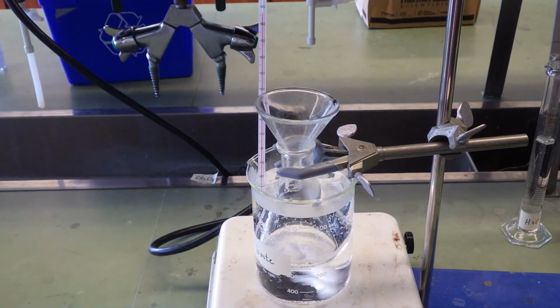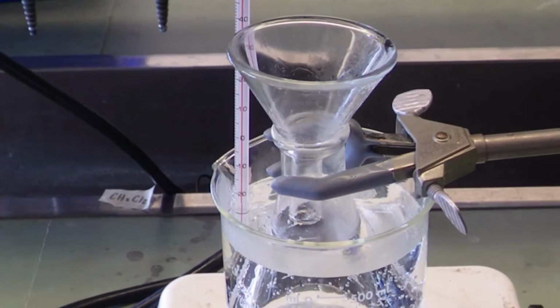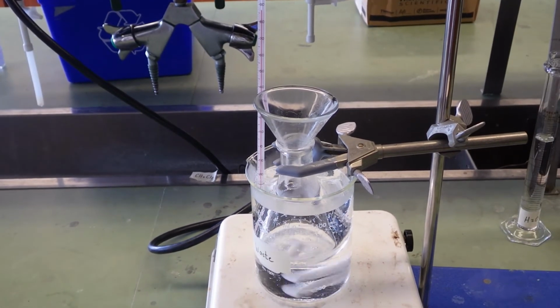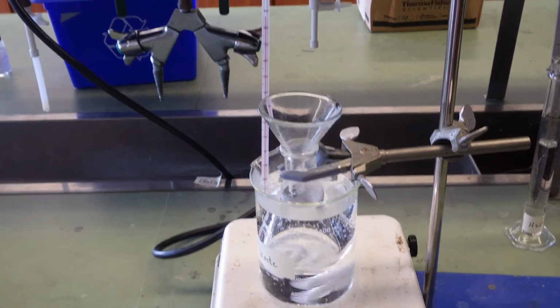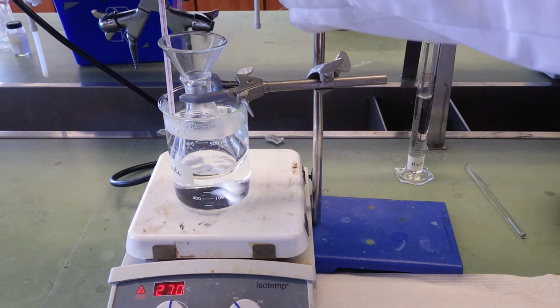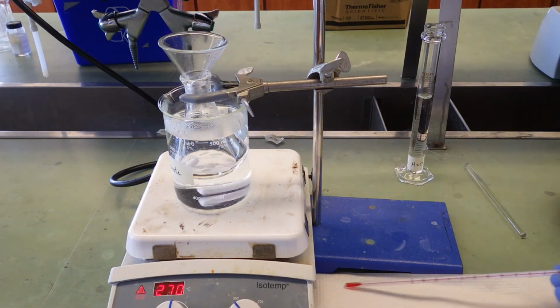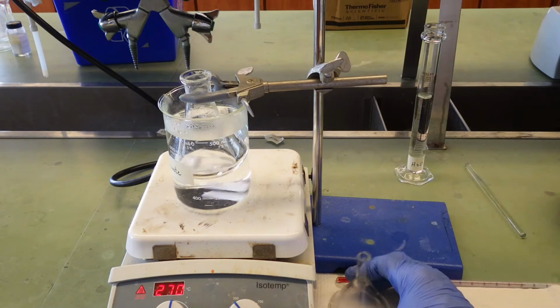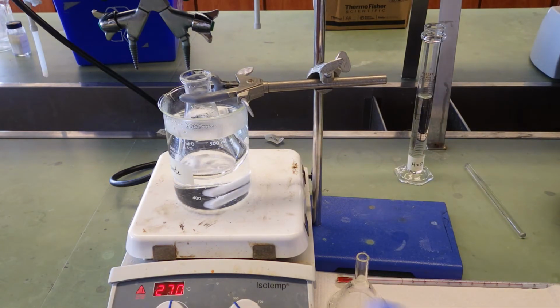You'll notice that I covered the flask with a powder funnel. That's to minimize the amount of solvent that evaporates. We don't want to lose solvent during the reaction. We'll heat it to 90 degrees C, and here it's been at 90 degrees C for at least 15 minutes. So we'll dismantle it and let it cool to room temperature.